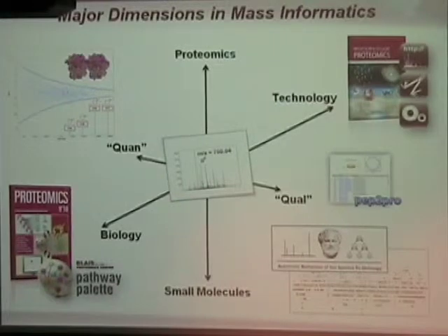Okay, and it's part of this mass informatics set of tools in the sense that you have a peptide. For example, this weirdness of not knowing whether it's a leucine or an isoleucine is a side effect of doing mass spectrometry. You don't get that when you sequence.